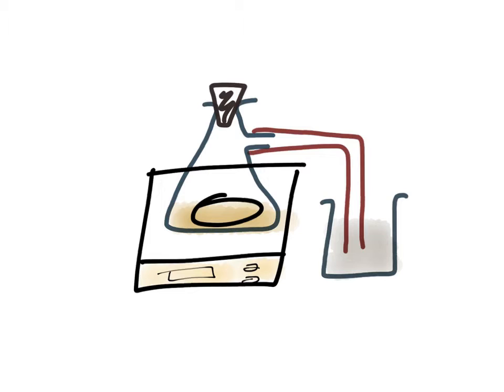and we just noticed that the actual mass went down as the fermentation continued, because fermentation produces CO2. The CO2 bubbled through here, it turned the lime water cloudy, indicating that it was CO2, and we just had a mass change. That's it.